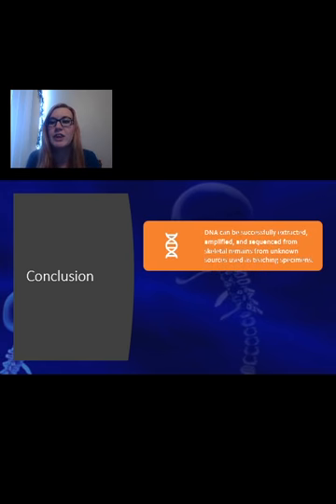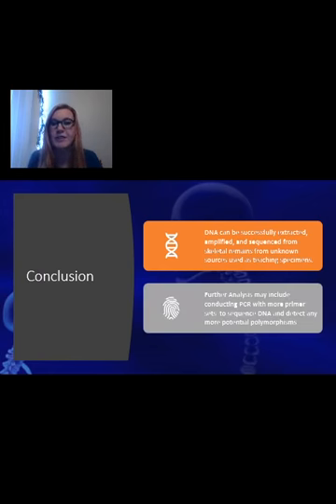So in conclusion, it was determined that DNA can be successfully extracted, amplified, and sequenced from skeletal remains from unknown sources that are used as teaching specimens. And further analysis may include conducting PCR with more primer sets to sequence the DNA and detect any more potential polymorphisms.